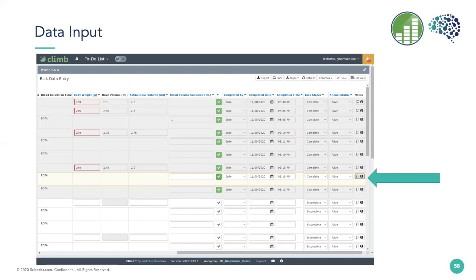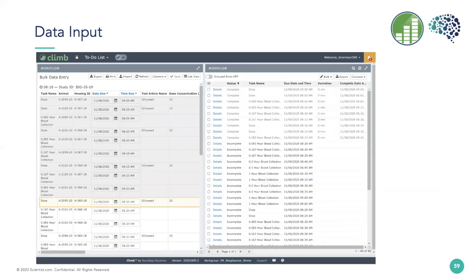Now, the database also records a count with each note, and the notes typically signify that there is something that needs to be reviewed. So the reviewer can actually come in situ in real time and review these notes. Now, the reviewers and the study directors can also look at the results in QC in real time.